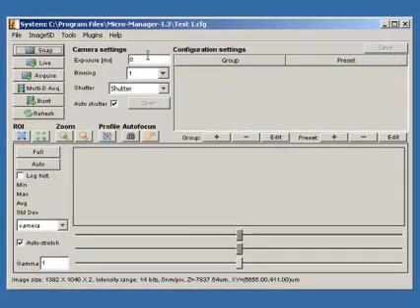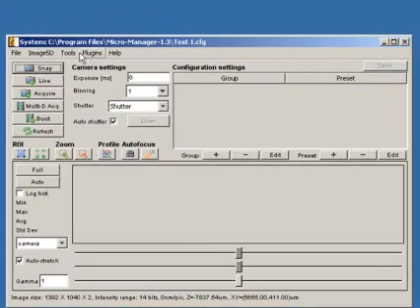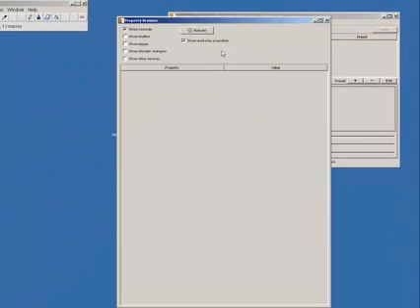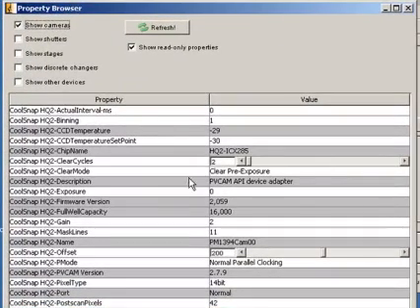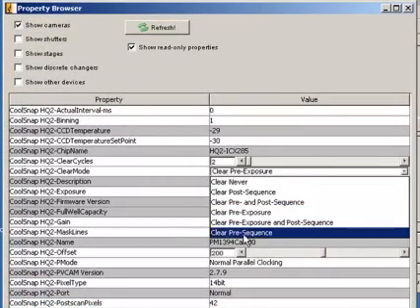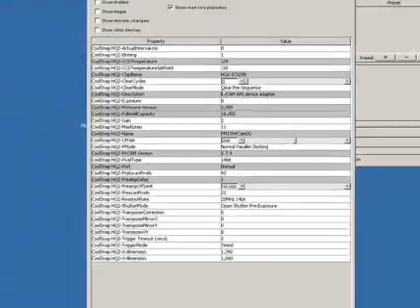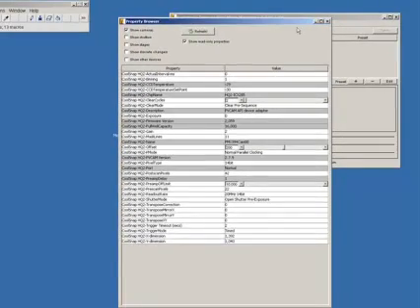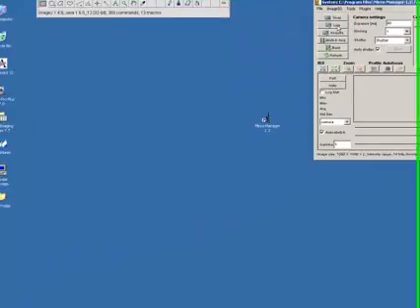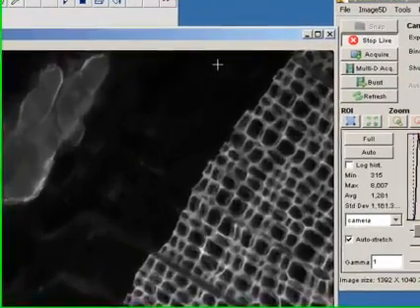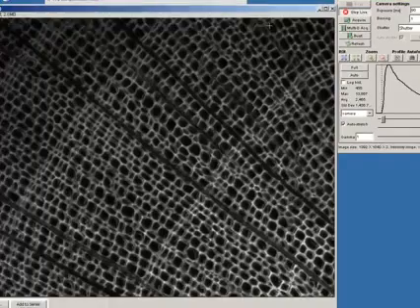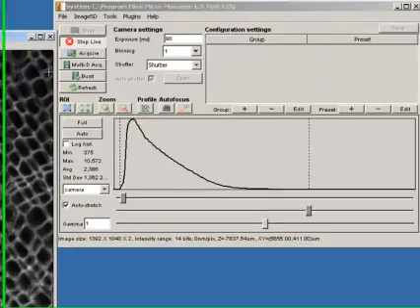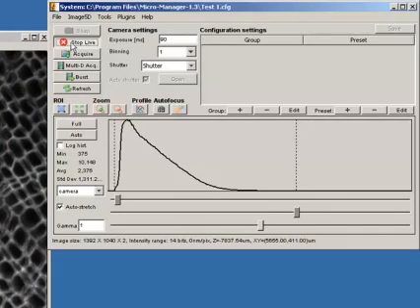So, once happy let's click exit there. And now we're in. So, first thing we need to do is set up the camera. So, if I come to tools here and then go to device property browser. This will give us all the settings here and I can make sure the camera is set correctly. So, at the moment it's down as clear pre-exposed. So, let's just quickly change that to clear pre-sequence. And everything else is as I want it for the camera which is fine. So, we can close that one. And then put an exposure time there. And let's just go live for a moment. And it'll open up the shutter. And we can see I've got my nice live image here. So, I can move around and have a look at my sample. So, that's fine. Everything's looking good there.